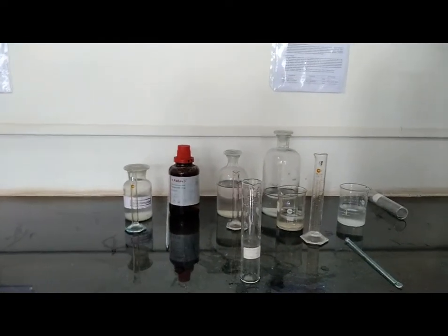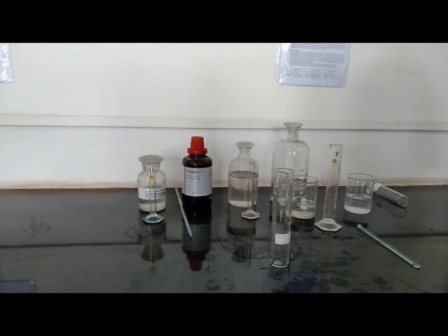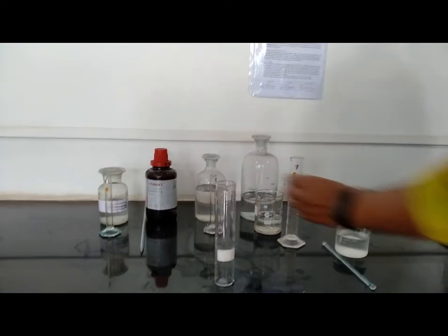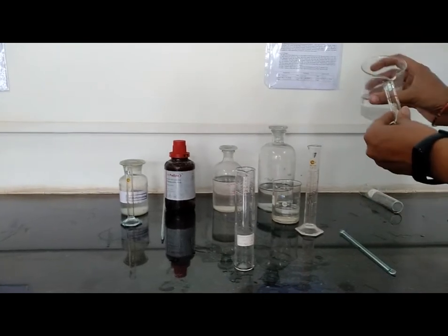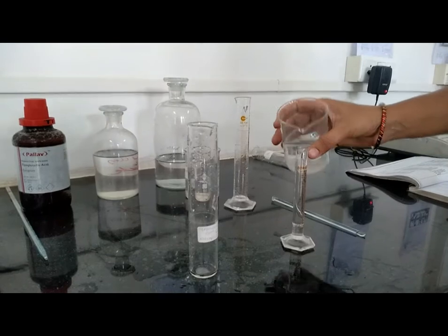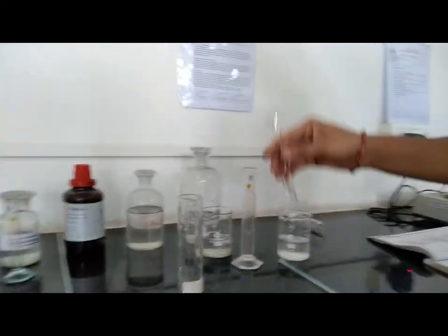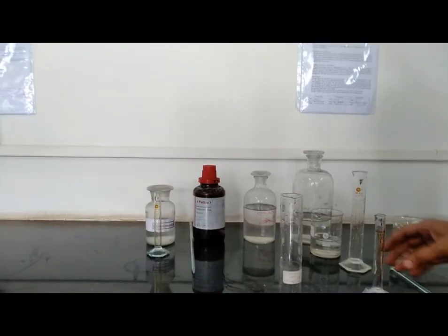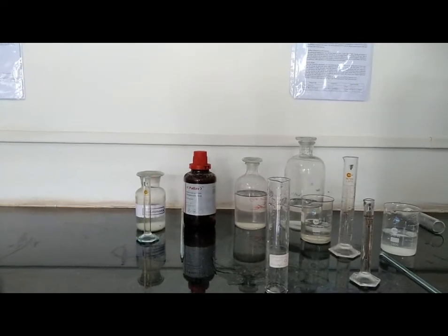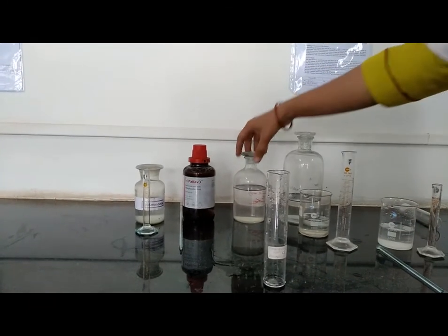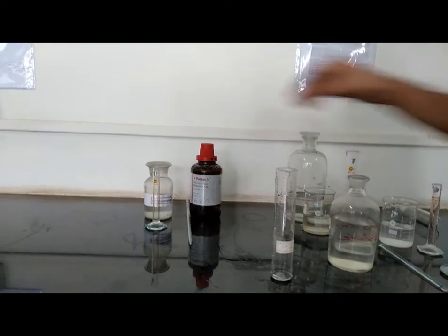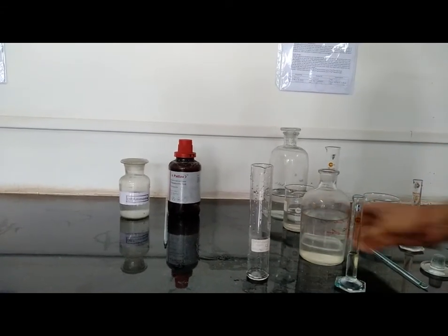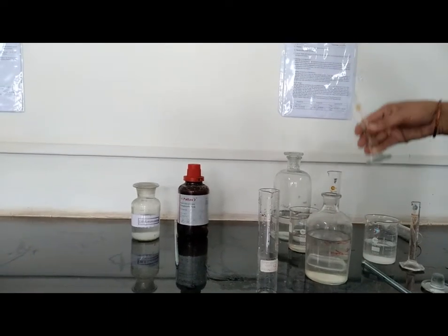Take 2 ml of iron standard solution. This is our iron standard solution which is freshly prepared. Take 2 ml of iron standard solution. Then add 2 ml of iron standard solution into the Nessler cylinder.